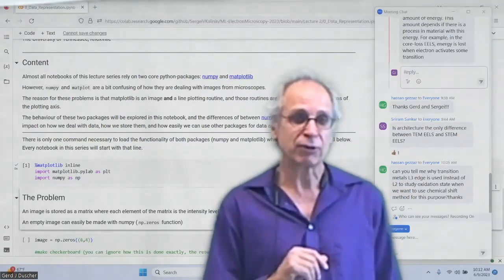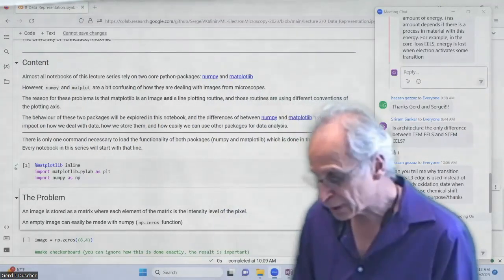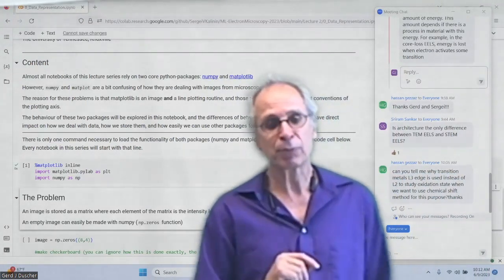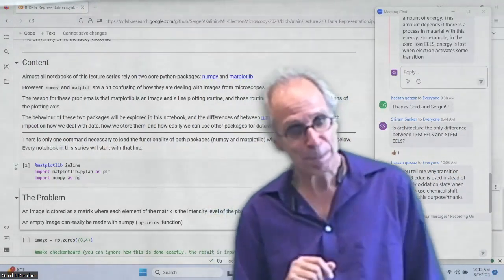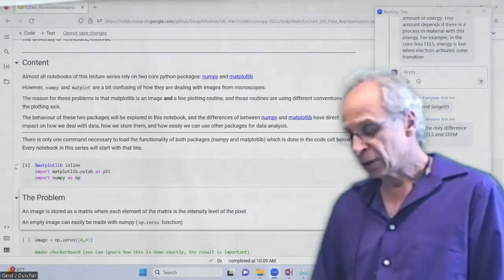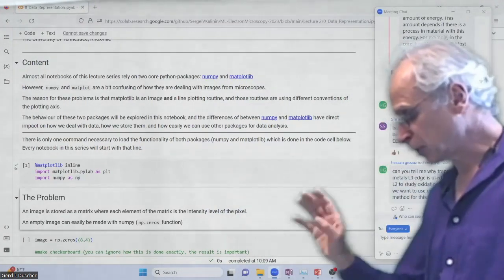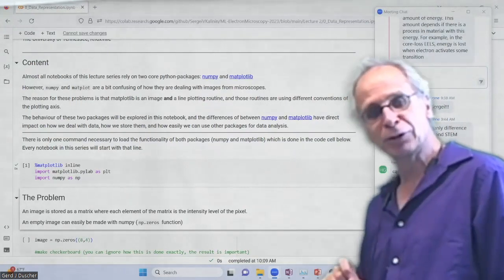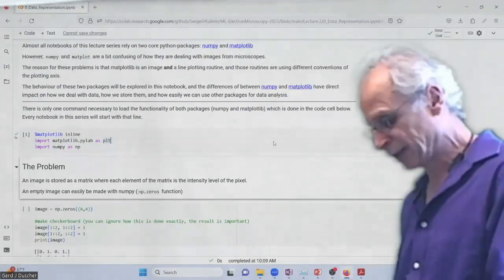Okay, so it's a model-based analysis of the EELS spectra. It's quite straightforward, say oxidation states. Now that I know this question, I will add something about that. But we can definitely not easily look at the oxidation state, so there are a lot of problems there. But okay, lots of EELS questions. So everybody look for the EELS lesson, and I'll handle that. If I don't, remind me, and I have it somewhere.